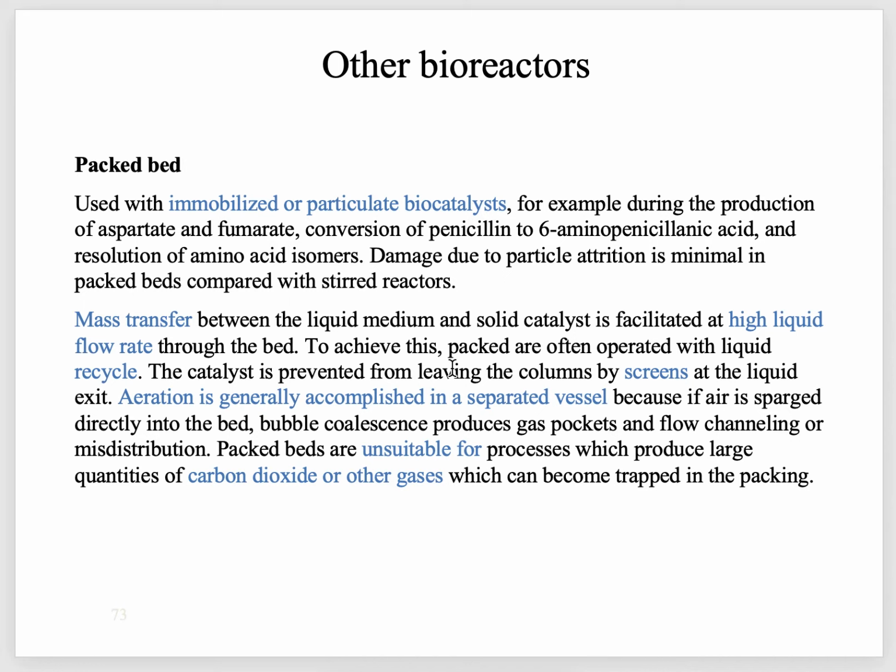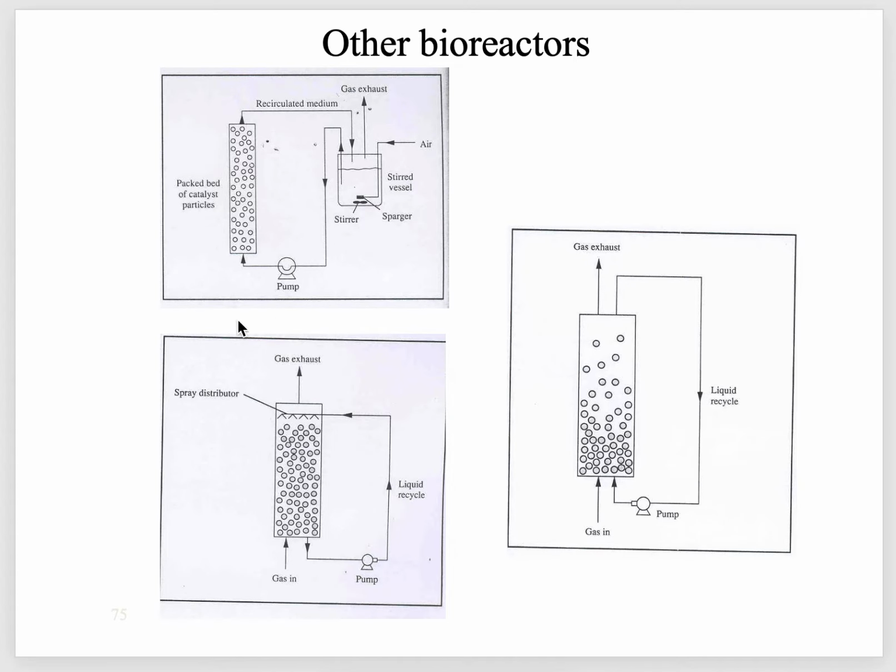Anyway, the catalyst is prevented from leaving the column by screens at the liquid exit. We are pumping the liquid from here, and it will create a force. Because of this force, the biocatalysts, although they are immobilized, could escape from here, but usually they are prevented. We can just use a screen here, something which will prevent the movement of the catalyst.